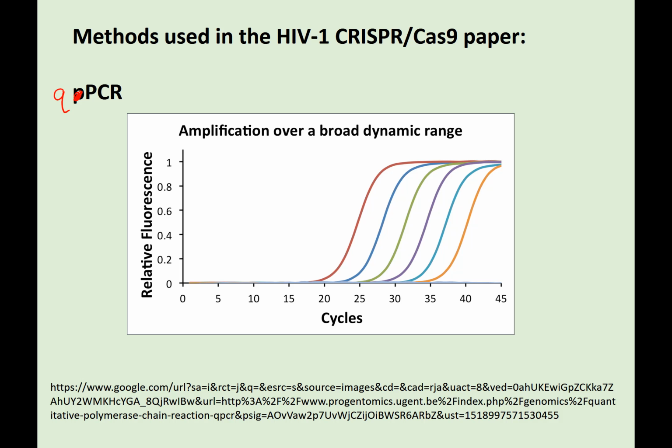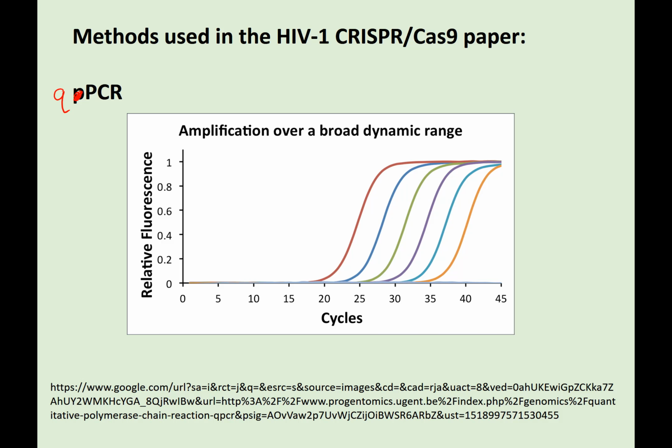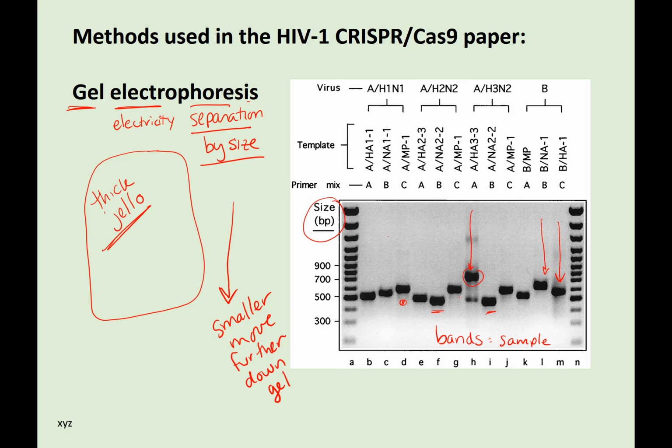So the way qPCR works, it's the same idea as PCR, but instead of just looking at what you make in the end after amplifying, the qPCR machine, let me write quantitative here, the qPCR machine measures how much DNA you have after every cycle. So in PCR, we do 30 or 40 cycles to get enough DNA to see on a gel. But that doesn't tell me, did this sample have more DNA than this sample? Were they the same?